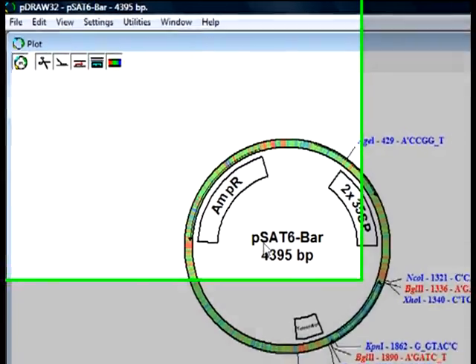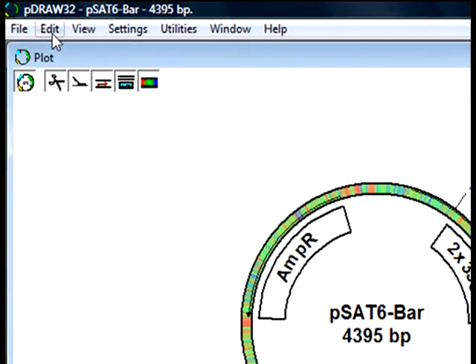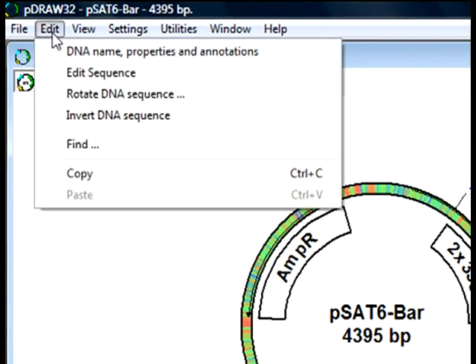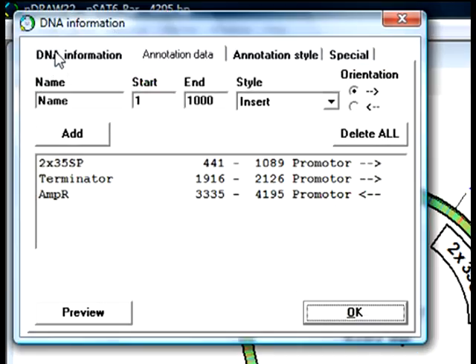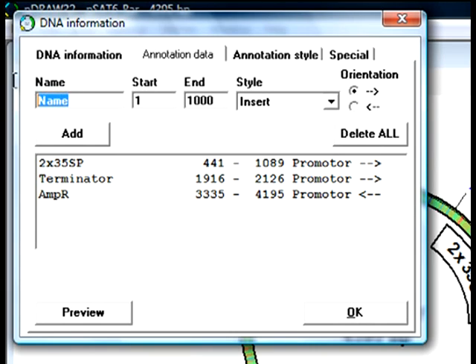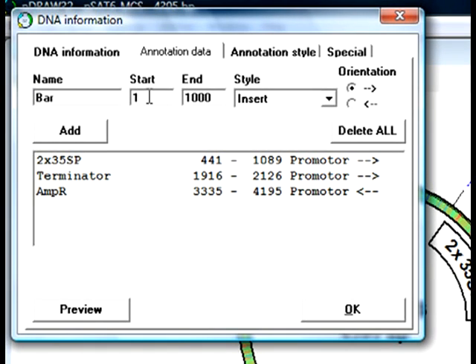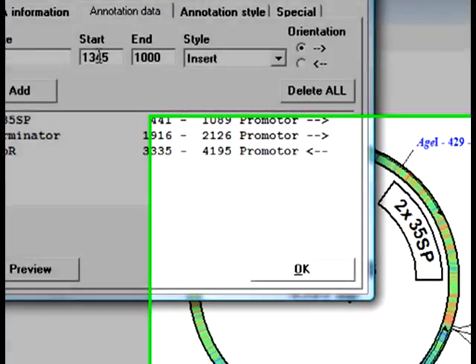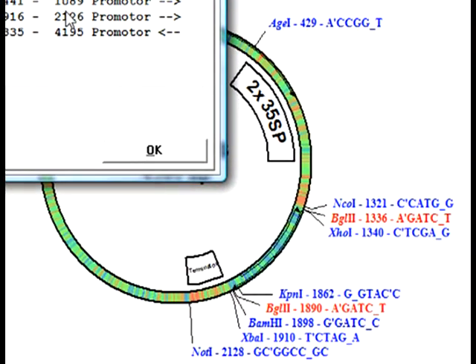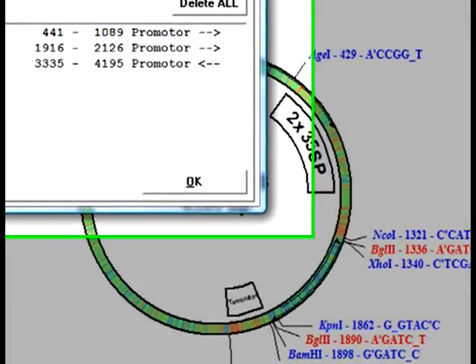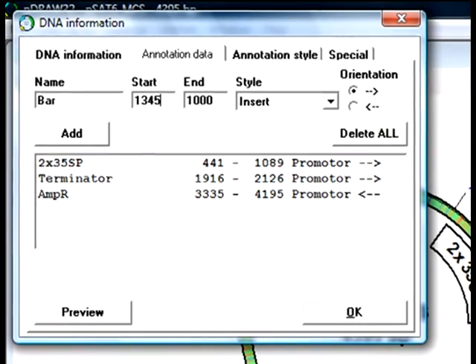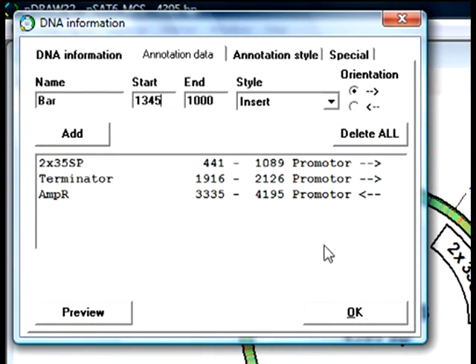For that I will go to Edit DNA annotations and add a new feature that will start in the position 1345, which is right after the XhoI site, and end in the position 1897, which is right before the BamHI site.